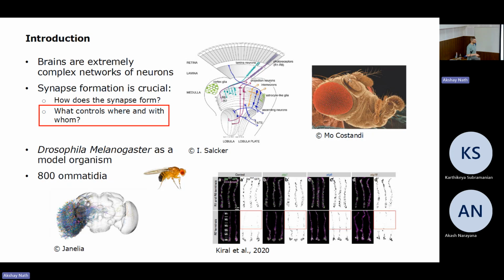Here we can see just the synapses, and the majority of these dots are located between layers M4 to M6. This is what usually happens, because the synaptic partner of this cell, typically a cell called DM8 or DM9, is located around here, so this cell is connecting to DM8 or DM9.